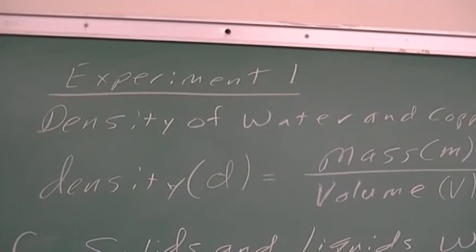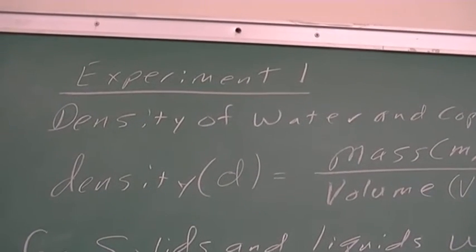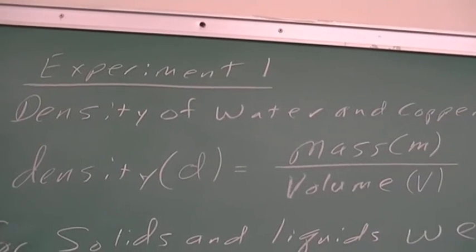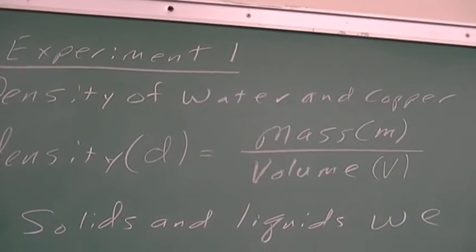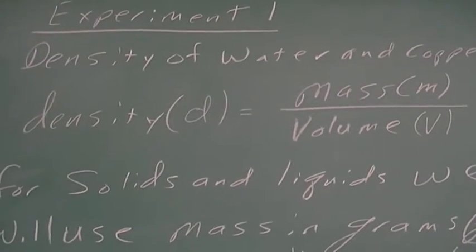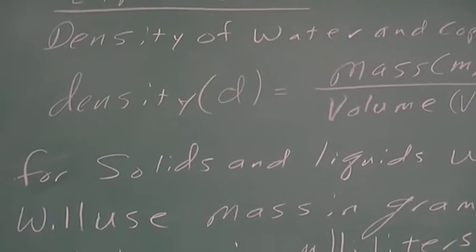Hello, I am Dr. Lewaiters, and today we are going to do experiment one, which is the density of water and copper. We're also going to do density of an unknown liquid and an unknown solid.